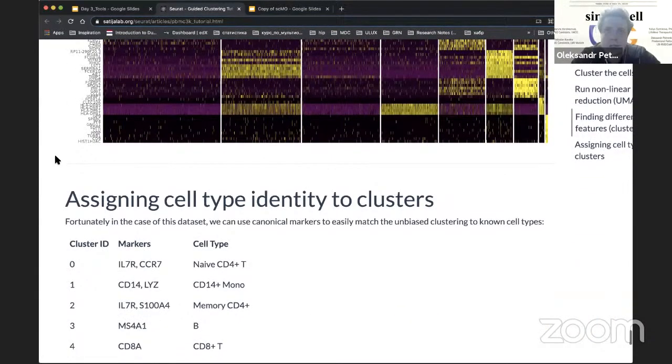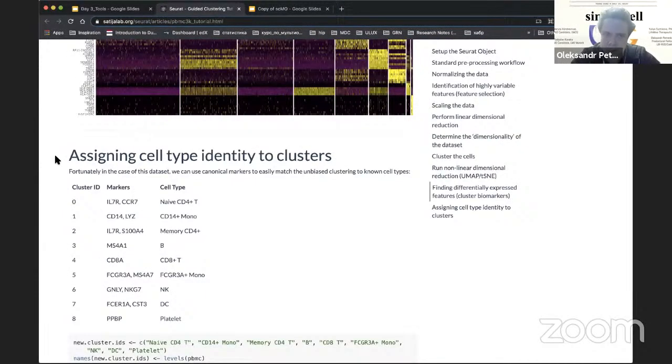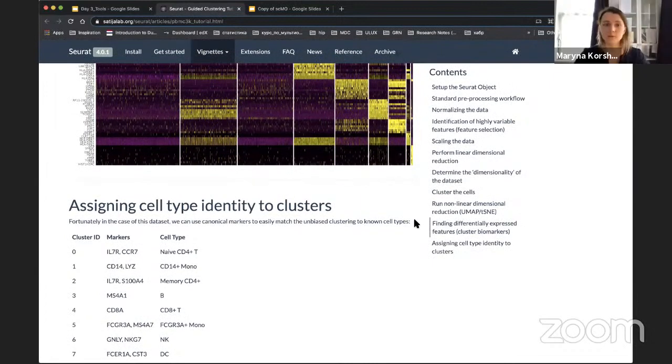There's also a question regarding the heat map. There is also an interactive way to access heat maps, right? And actually many of these steps. The Shiny apps. Yeah, we will talk about that. It was my decision that I started working on interactive data analysis too, and I realized that we cannot guide our participants literally through single cell processing. That is why we are finishing with Seurat and we'll go to interactive data. Perfect. Then your question will be answered slightly later.